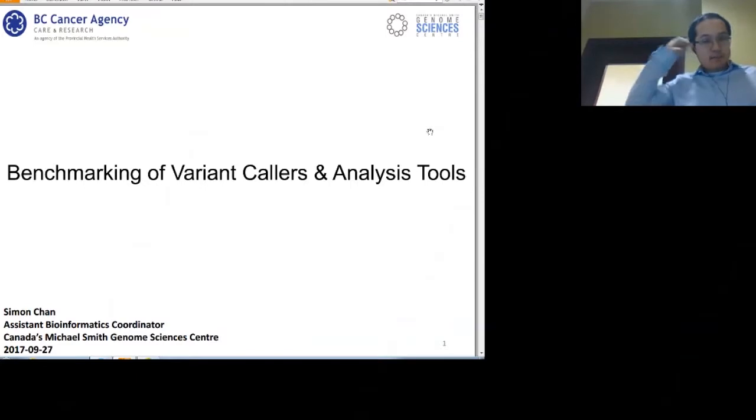Today I'm going to be talking a little bit about some of the benchmarking work that we do here at the GSC. So let's get started. First, just to ensure that we're all on the same page, I'm going to give a very, very high-level overview of the Illumina sequencing that we perform here at the GSC.